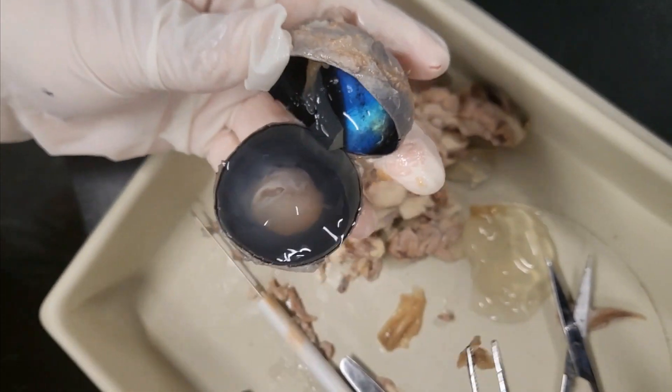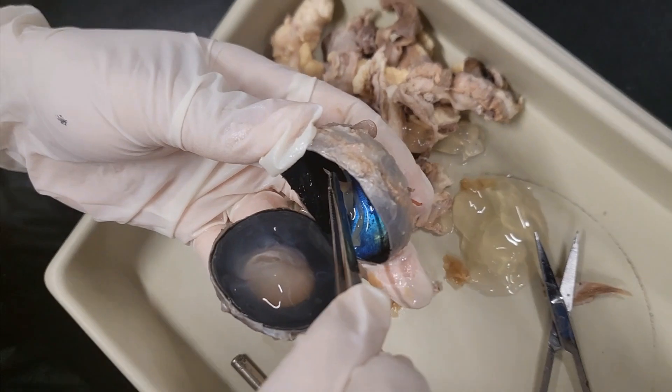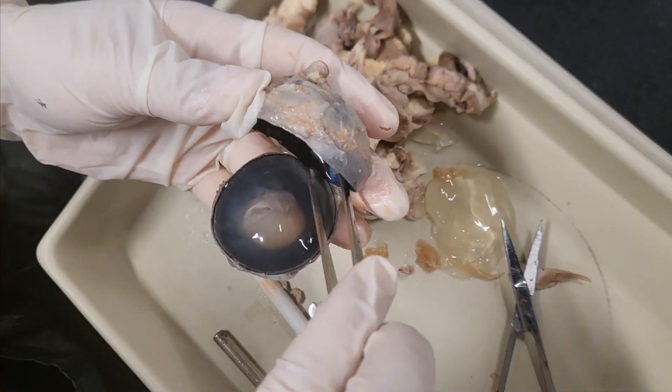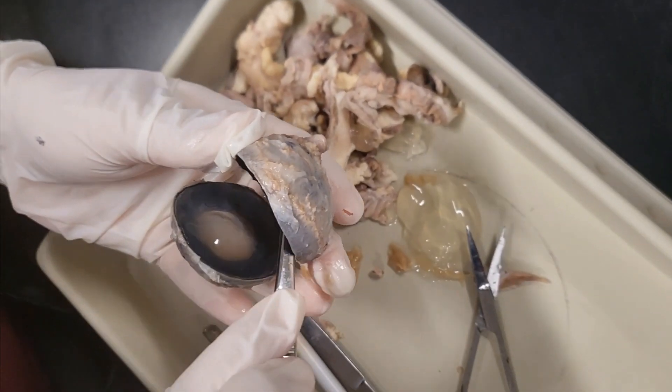Look at this! What's going on? That's the optic disc. Yeah, this is the optic disc, and you can see that it corresponds to the optic curve in the back.